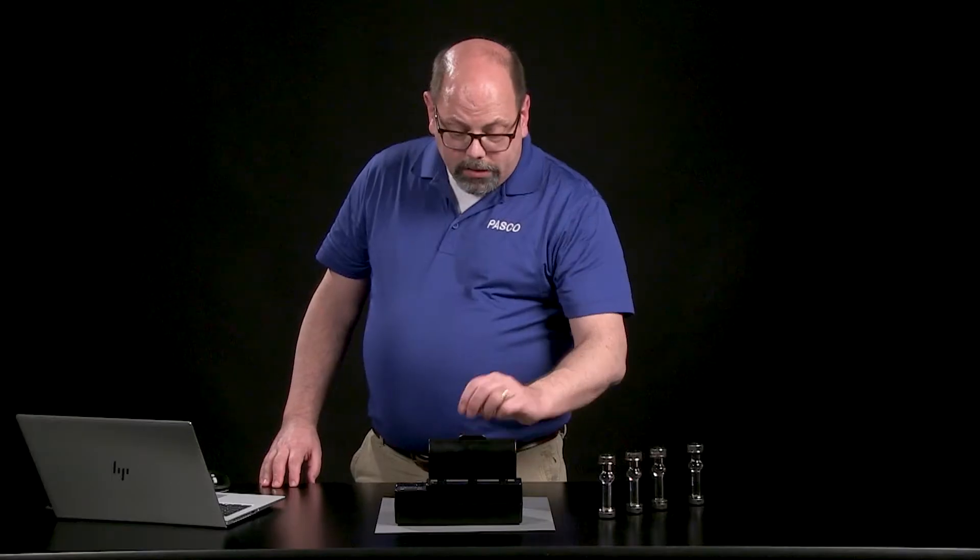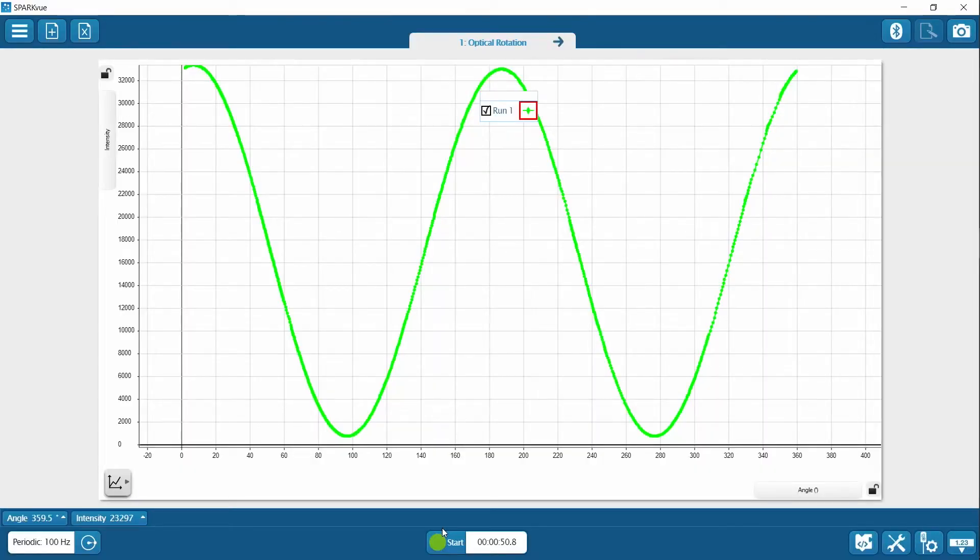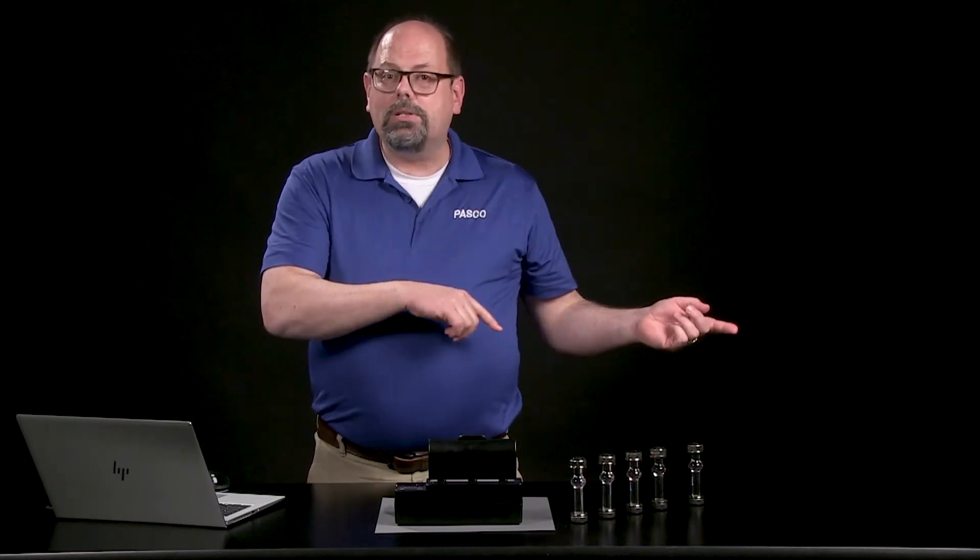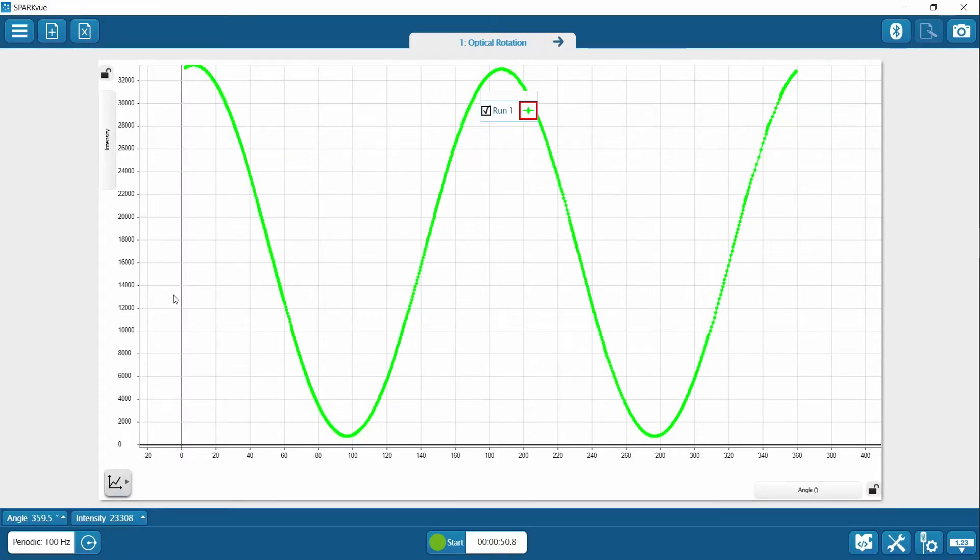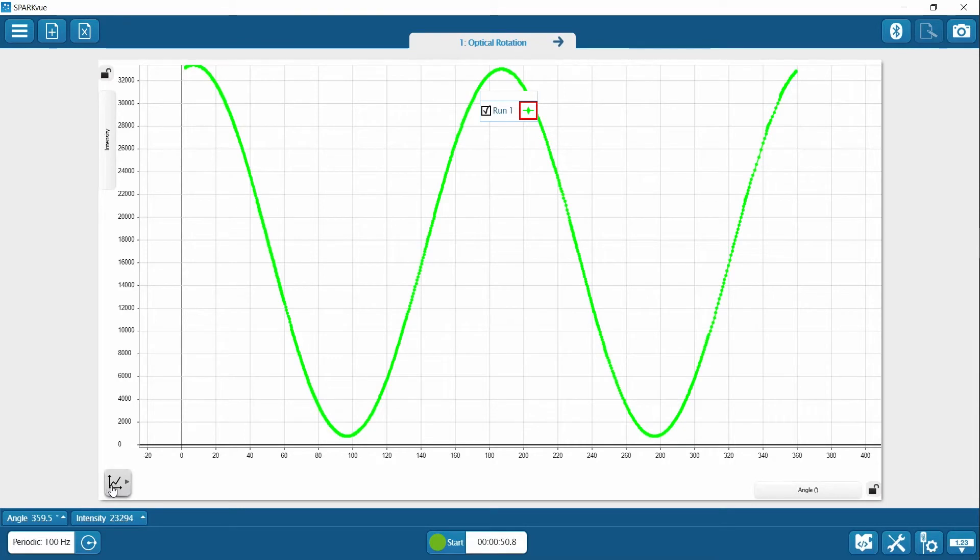If I want to find out one of the places anywhere in this—it looks like a wave, anywhere on the sine curve—I just need to measure the same piece from one solution to the next. Usually we would say in the directions to find the first full peak past the starting place. This is not quite a full peak, this one right here, even though it's the first peak. We're going to go to the second one, which is the first full peak. We're going to use the tools available to us to find out what that peak value is.